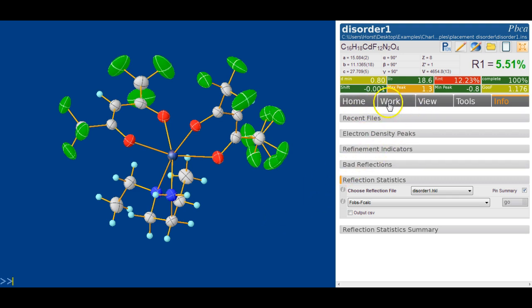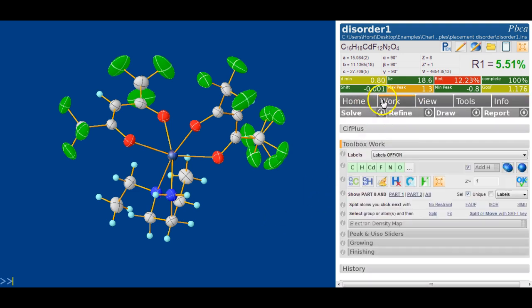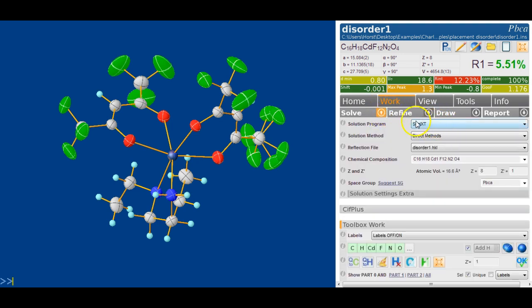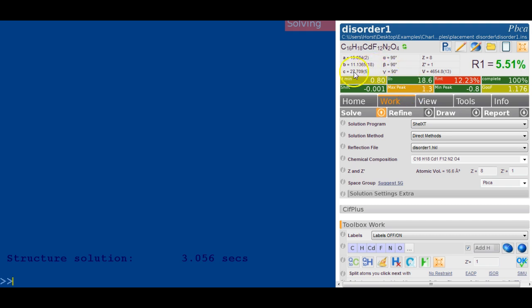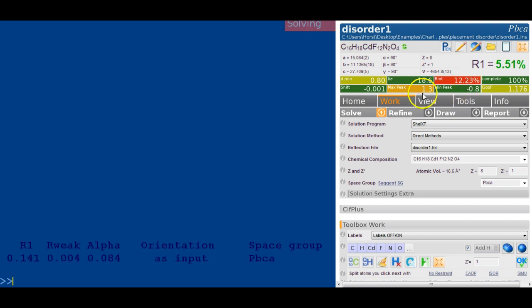In order to start, we will solve the structure first. We go over to Work and Solution, and I'm going to choose to use Shell XT to solve the structure, which gives a nice quick solution. In the meantime, we can look at the data. We've got a standard resolution data set, fairly strong, but the Rint is quite high, so the data aren't very self-consistent, but it's probably something we can live with.